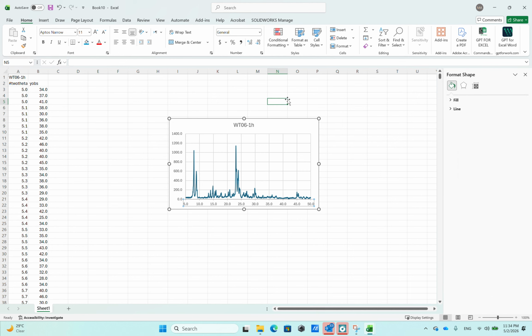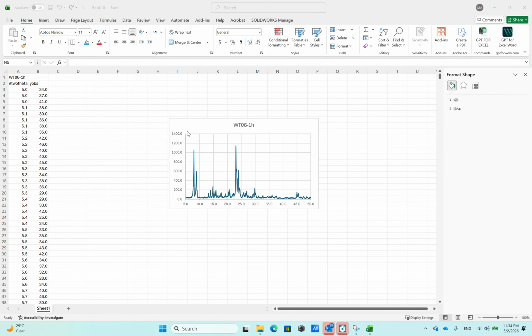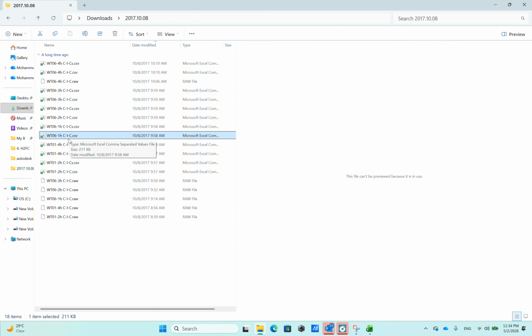That's it. Now, if I have another sample that I need to draw with this result, how can I do that? Simply, you can open the sample name. In my case, let's see, this is the result.